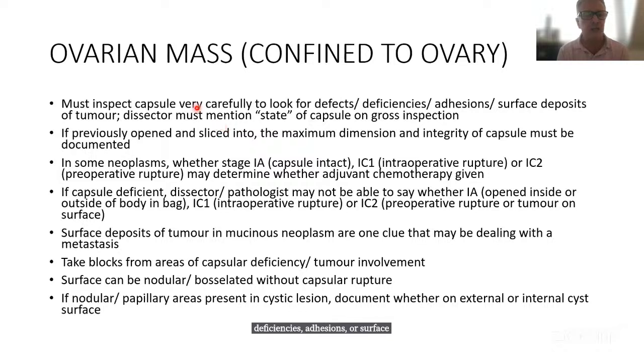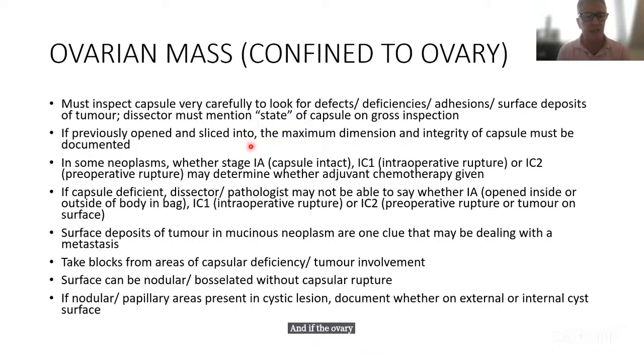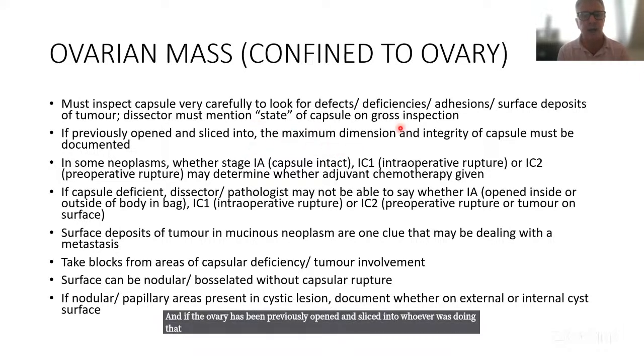So whoever's dissecting the ovarian mass must mention the state of the capsule in gross inspection. And if the ovary has been previously opened and sliced into, whoever was doing that must record the maximum dimension and the integrity of the capsule.